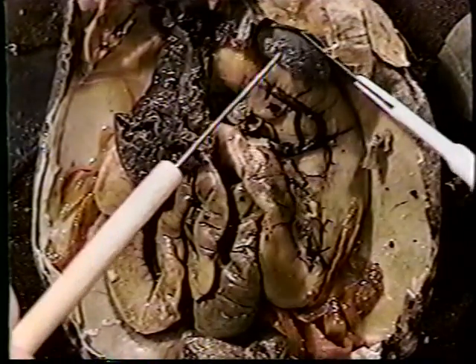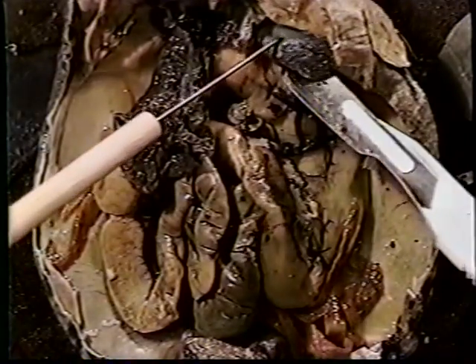Keeping in mind the area in which the heart used to be, the lungs are advantageously positioned. Both may not appear to be the same size due to the fact that the frog's left lung will be competing for space with the beginning part of its stomach.